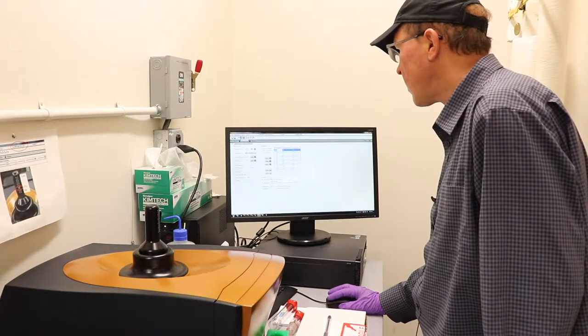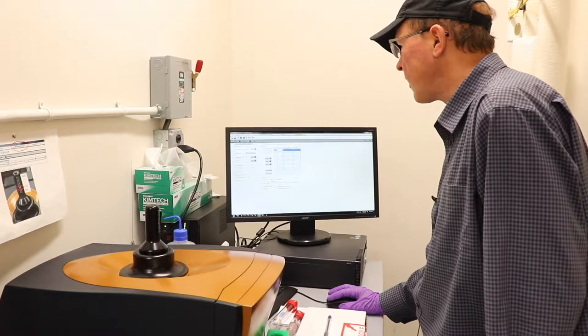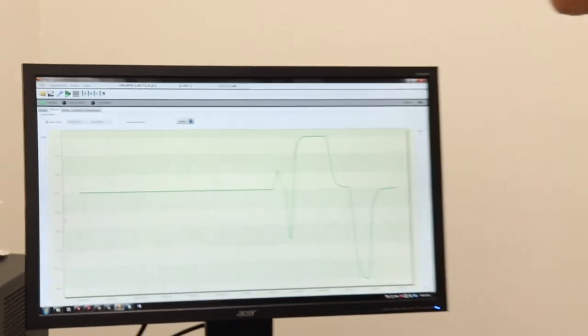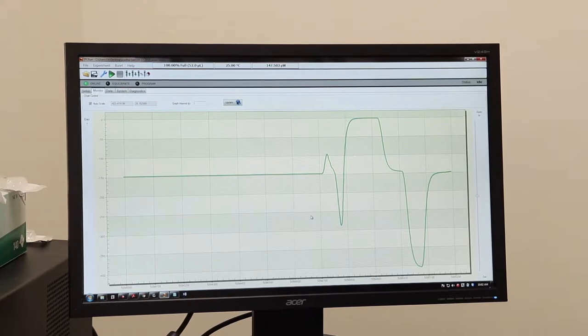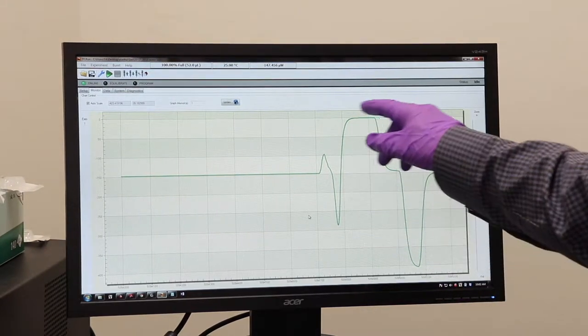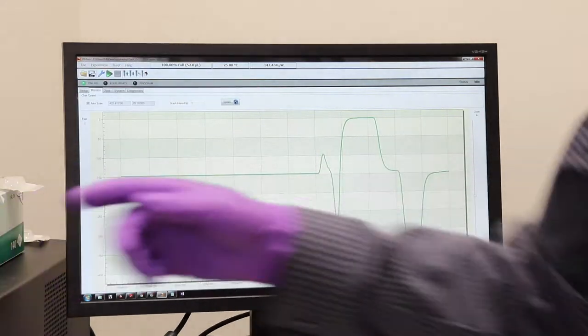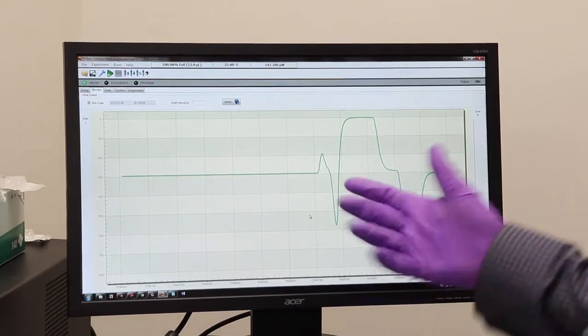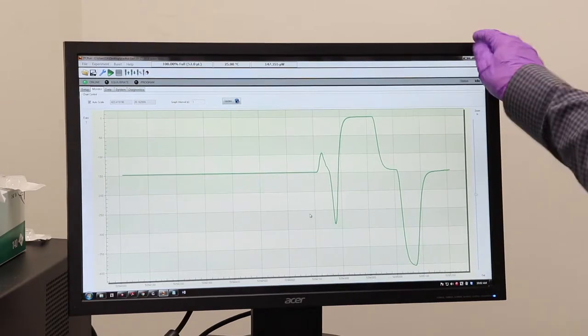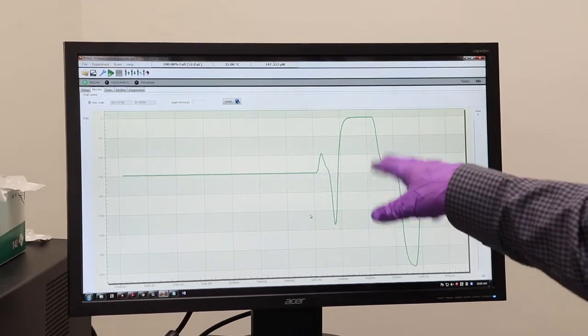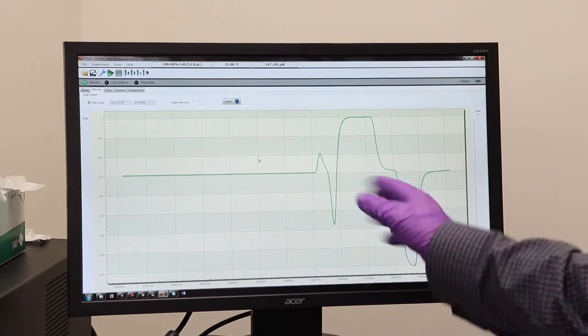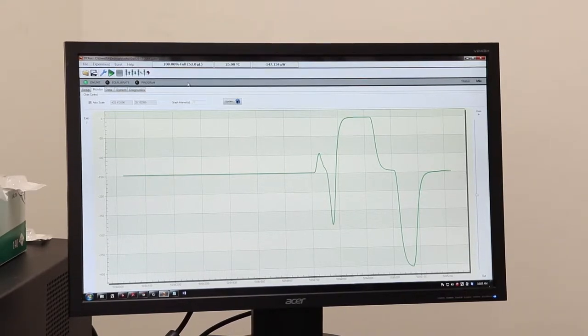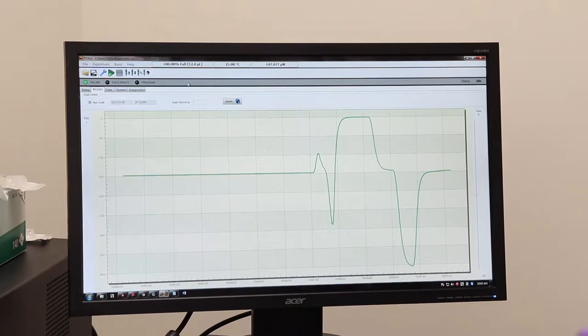Okay. So if we start the experiment up here. So I normally wait a little bit to start the experiment. So if we go to the monitor screen, this basically shows time and the change in heat here. Basically, these giant jumps here are me taking the burette in and out of the holder and turning the stir bar on and everything. So when it starts, when you start the program, it'll start the auto-calibration and try to get a nice stable slope. That's not going to happen while this is still recent. So I usually wait 10, 20 minutes and then I'll start the actual experiment.